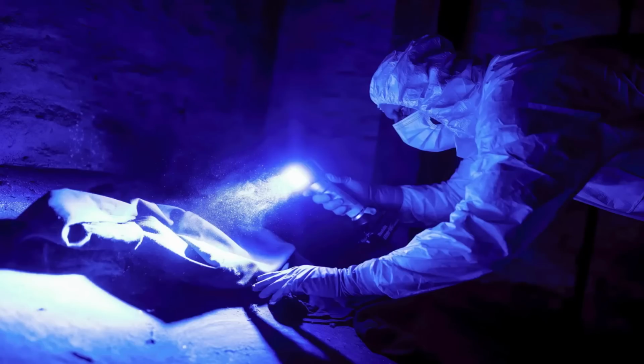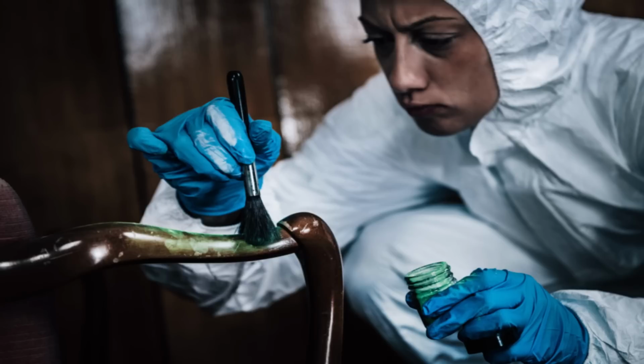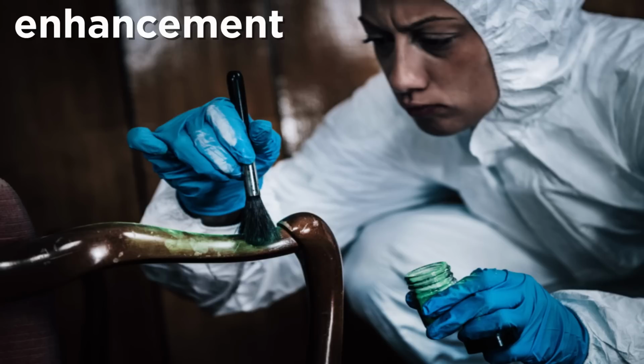This initial examination can be done using alternate light sources. Some of the fingerprints might be readily visible at this stage. Regardless, initial examination of the fingerprints is followed by their enhancement using different techniques. Enhancement results in sufficient contrast between a fingerprint and its surface such that all ridge details are readily visible.